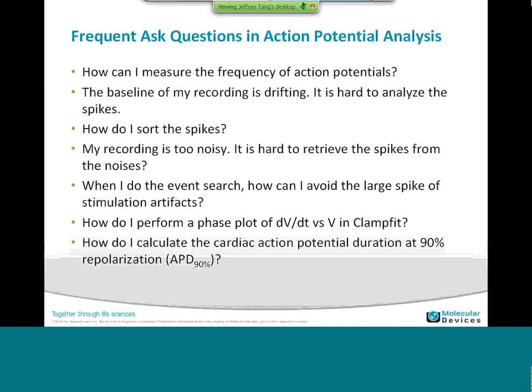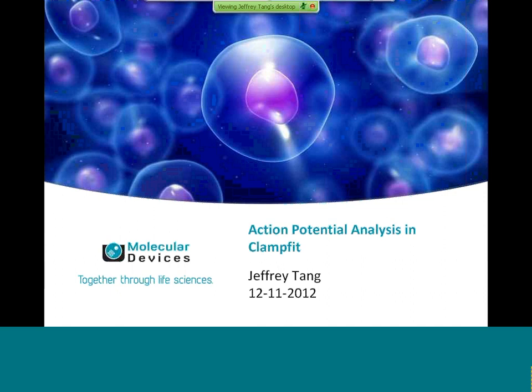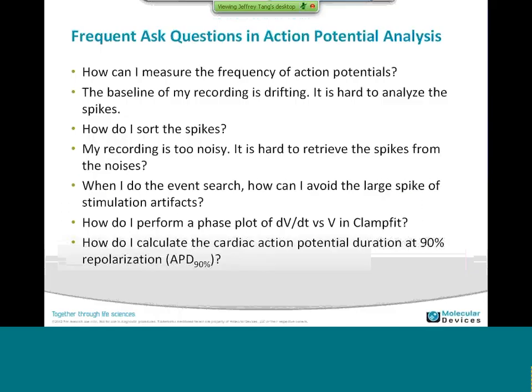So I have received questions, so let me start. Today my presentation title is Action Potential Analysis in Clampfit. In the past several years, I have received questions from customers asking about how to analyze action potentials. The following are the frequently asked questions.